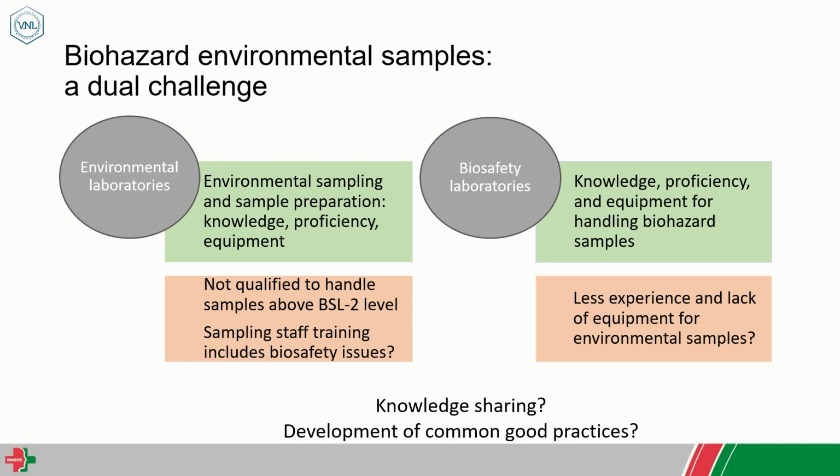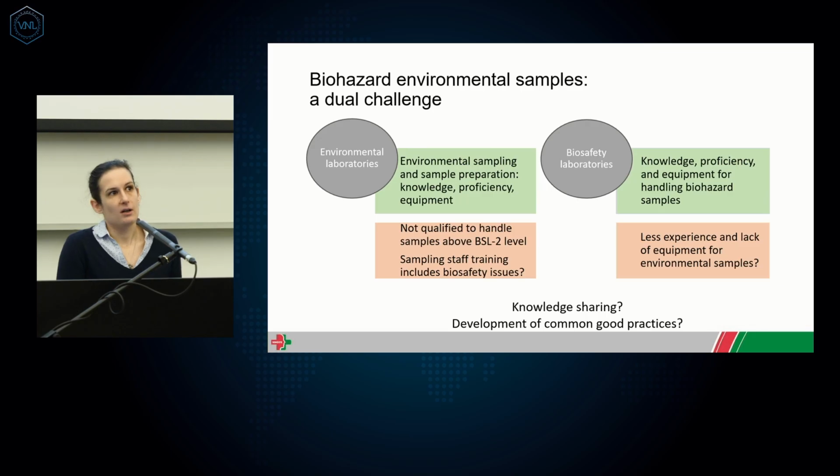And on the contrary, biosafety laboratories do know how to handle these very high-level risk samples. However, they may not be familiar with the special requirements for environmental samples. They may not have the experience or the equipment required for this task.